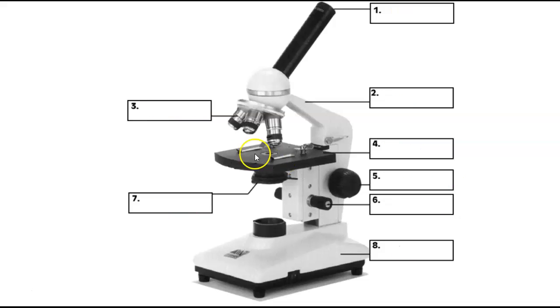So those are the parts of the microscope. Recap, to carry it, we need to use the arm and the base. We're always going to start on the lowest power. Okay, and when we use the low power, we're going to use the big knob. When we switch to medium and high, we're going to only use the fine focus, the small knob. Diaphragm allows light in. Eyepiece has a lens that magnifies it 10 times.